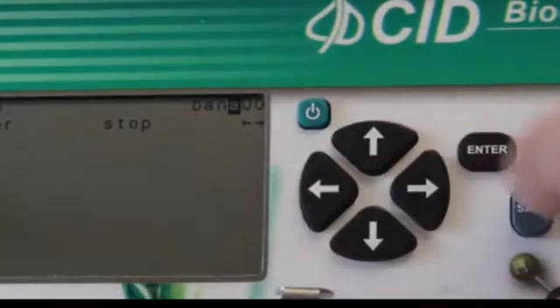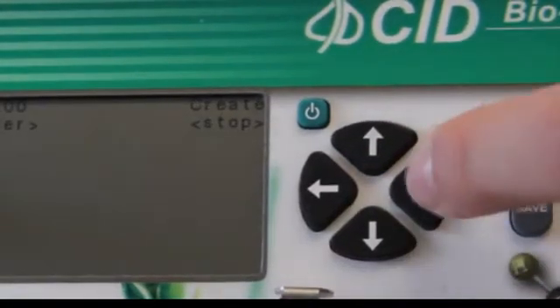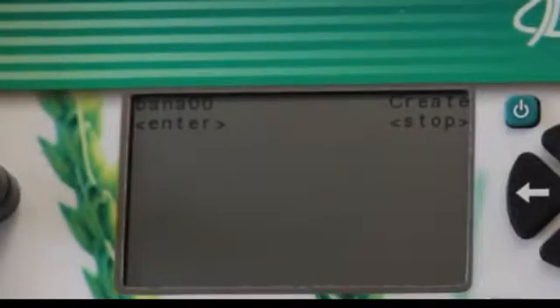Once we are done, we click Enter to save the file. The CI900 will ask us to confirm that this is the name we want for our file.